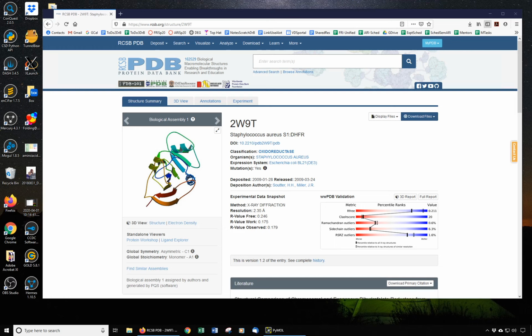We're going to go to virtual screening and using Gold. Gold needs to know where the active site is. But if our structure is an apo structure or doesn't have any ligands bound, we may not know exactly where the active site is going to be. This can help us basically steal a ligand from another structure that does have a ligand bound. So often we call the empty structure the apo structure, and we call the structure that has all the substrates present the holoenzyme. So we can take from the holoenzyme, align it with the apo enzyme.